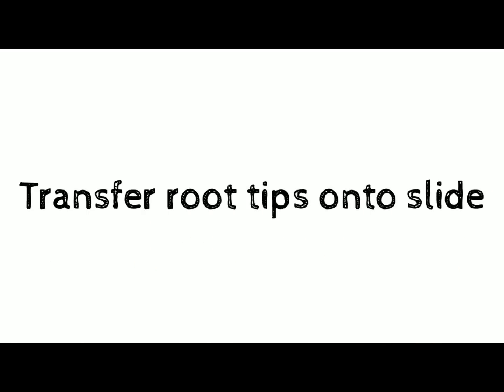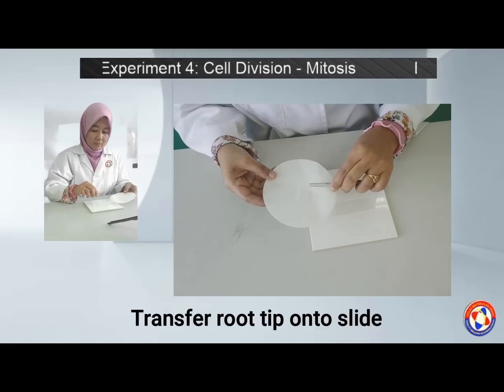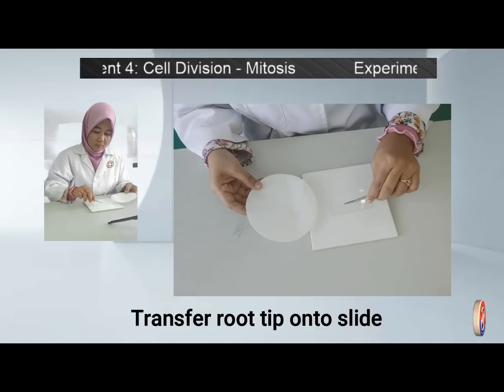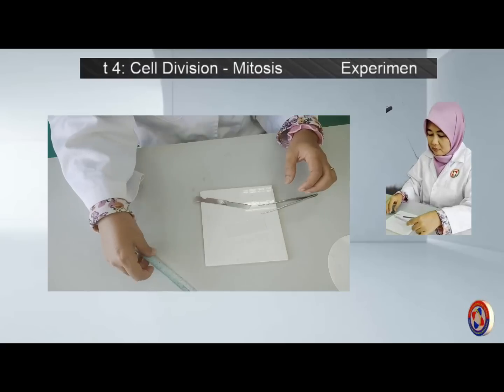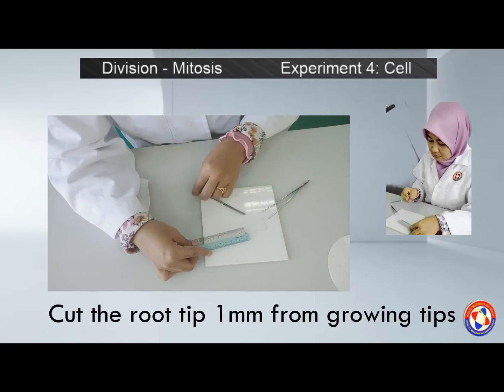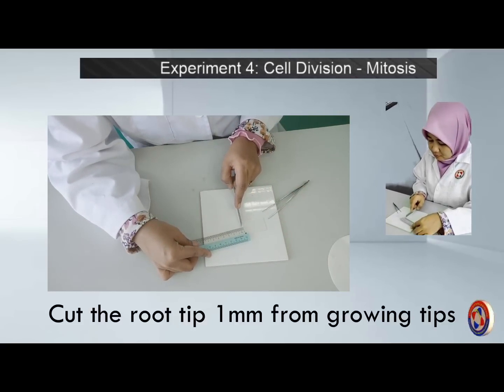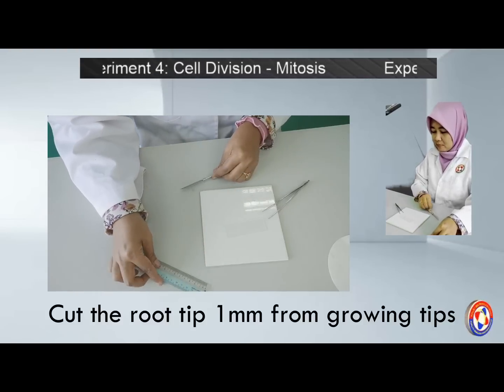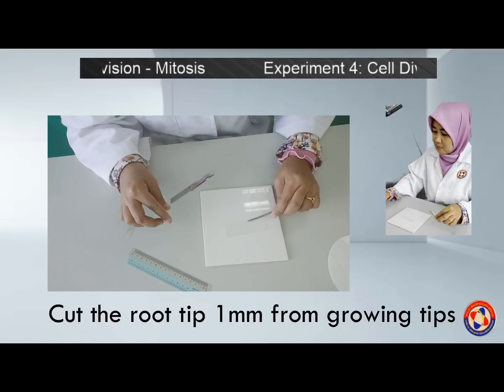Next, transfer the root tips onto a clean microscope slide. Cut the root tips about 1 mm from the growing tip — keep the tips and discard the rest. Then macerate the root tips with a mounted needle.